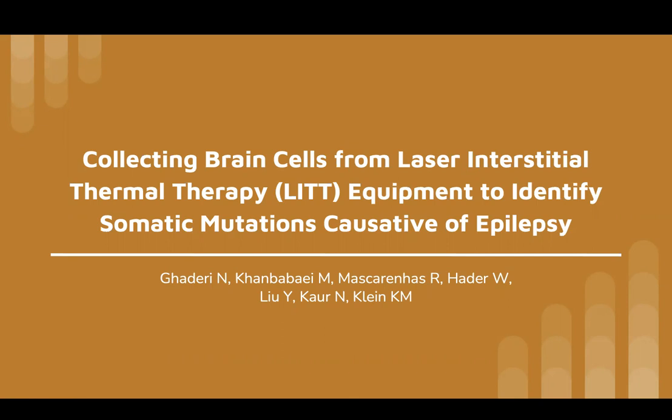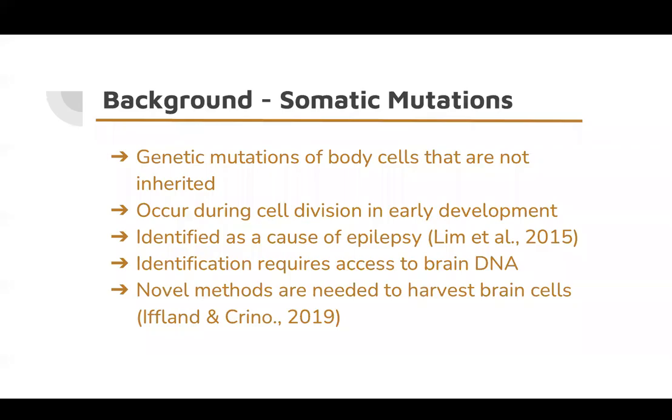Hello, my name is Navid Ghaderi and I'm a third-year neuroscience student. My research is focused on the development and application of a novel technique to collect brain cells from laser interstitial thermal therapy equipment and extract their DNA with the prospect of identifying somatic mutations that cause epilepsy.